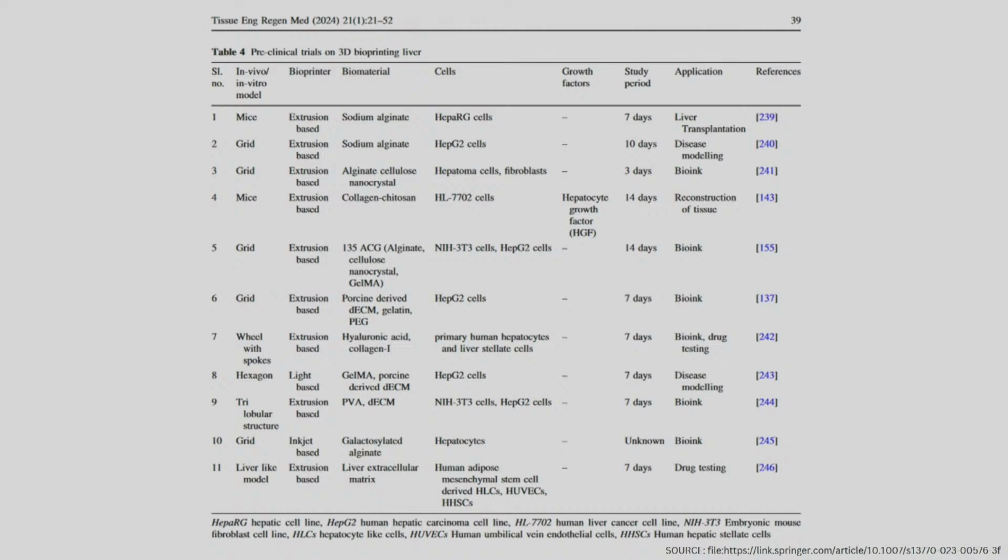If you see here, there's a compressor attached beside the machine. That's a compressor which is basically providing compressed air inside the 3D bioprinter. So there's an inlet and there's an outlet. The outlet is basically going to the extruder heads. As and when we switch on the compressor, we can regulate how much pressure we are giving inside the extruder head. See here, there are two extruder heads that will be holding the syringe, with the material inside.